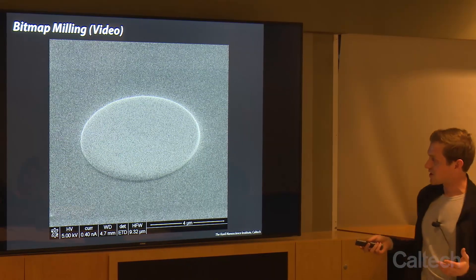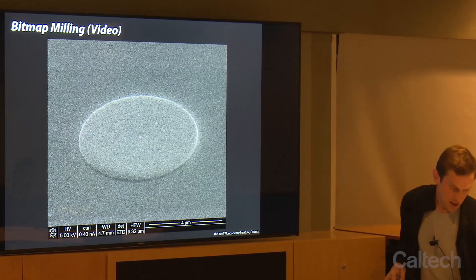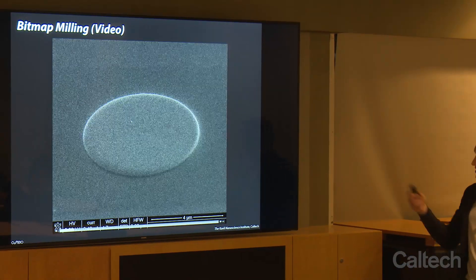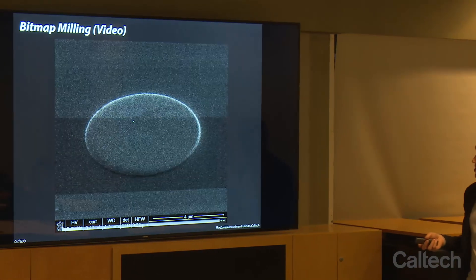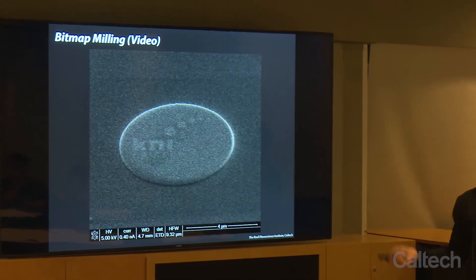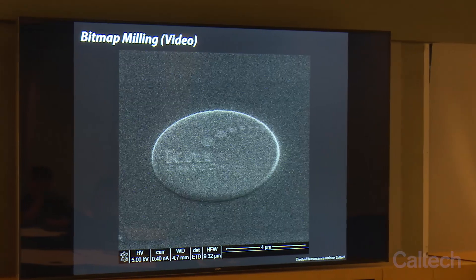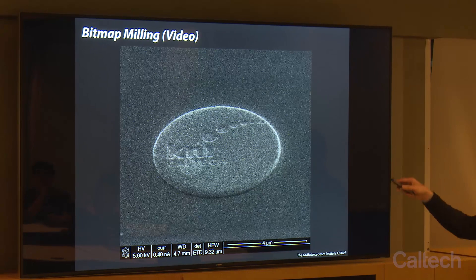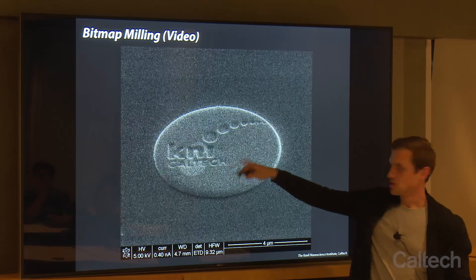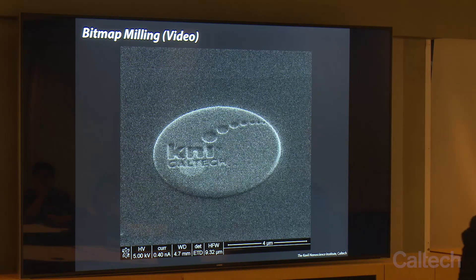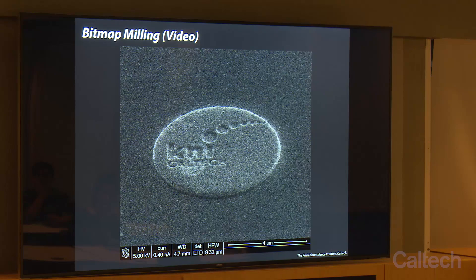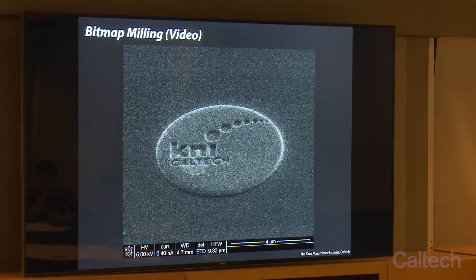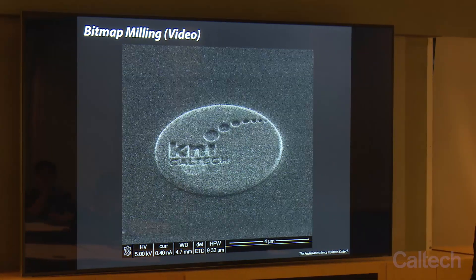I'll show how we can etch into that platinum the old KNI logo — this is something I did several years ago. We're using a bitmap to do this, etching differently based on the grayscales in the bitmap. White pixels etch deeper, and dark pixels don't etch quite as deep. So you can do 3D milling in this way.